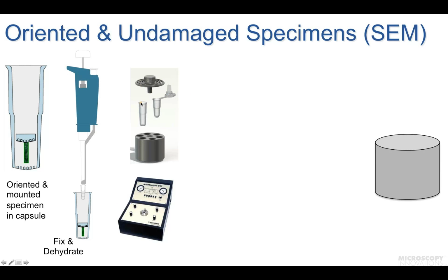And so here the capsules, either the specimen capsules or the grid capsules can be done, but we're talking specimens here. When they're placed in the capsule, this lid makes sure the capsule stays in the holder.